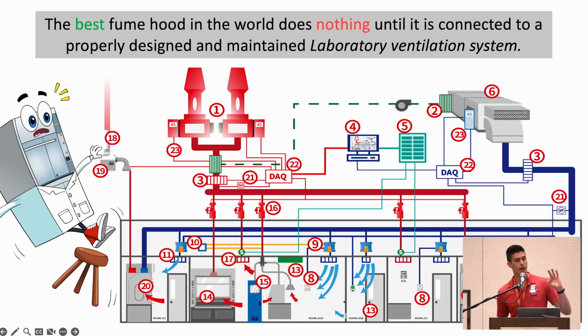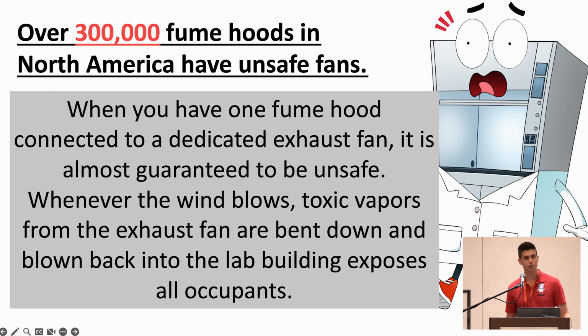Our founder of the company, Chip Albright, says it like this: It's a three-legged stool. It requires a good user, a good fume hood, and a good HVAC system. If any one of those parts is missing, you're going to end up like my friend Lee here, and your school's not going to support you. So, hope that was helpful, showing some of those examples of local and large smoke. Victor?